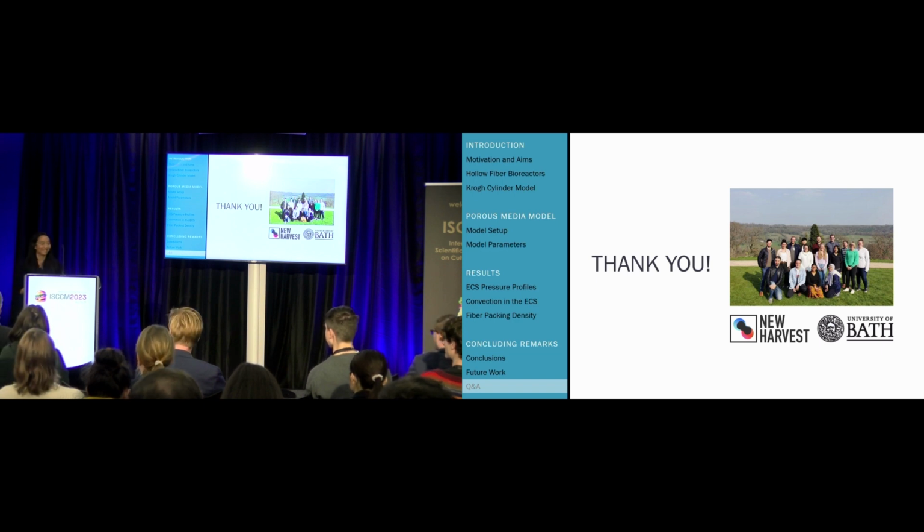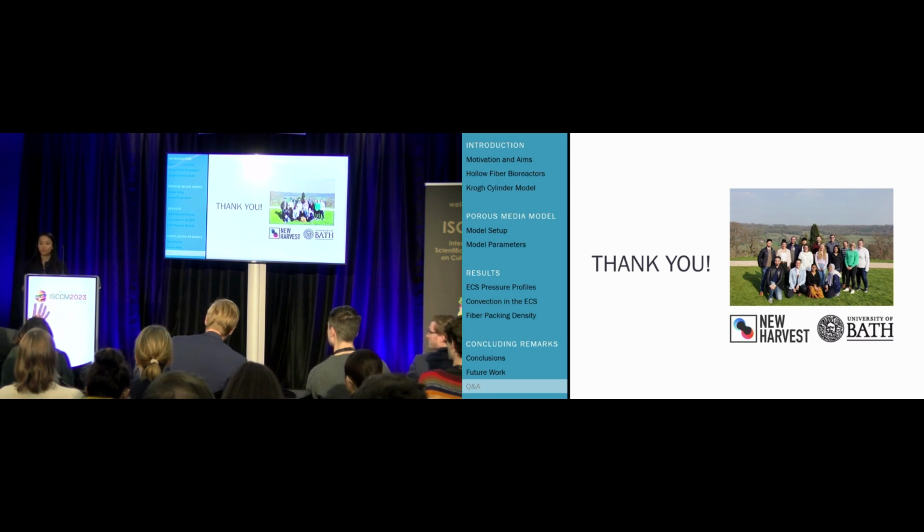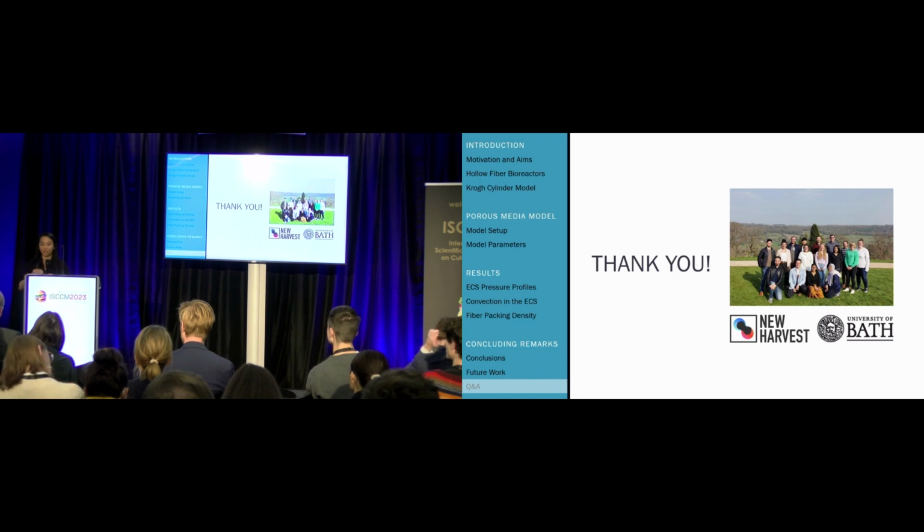Thanks, Lily. Wonderful presentation. In how far is cell proliferation actually a parameter in this? So in other words, some of them are developing these hollow fiber bioreactors for differentiation, where there's more a steady state of metabolism in the cells. How far is that important? So this just looked at, as you increase the cell densities at steady state, what the pressure and velocity profiles look like.